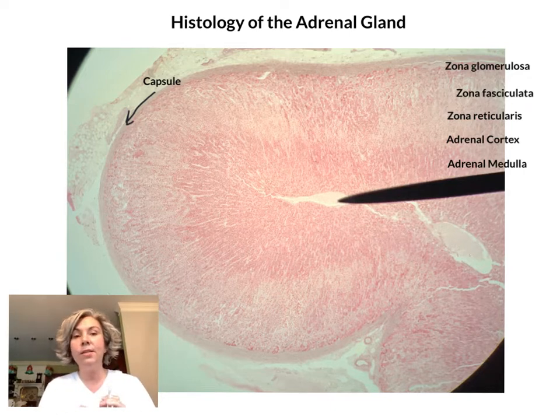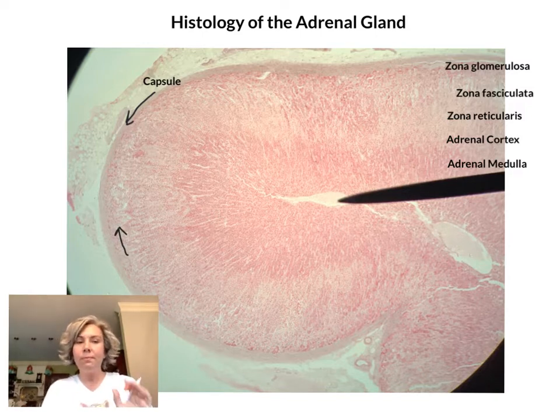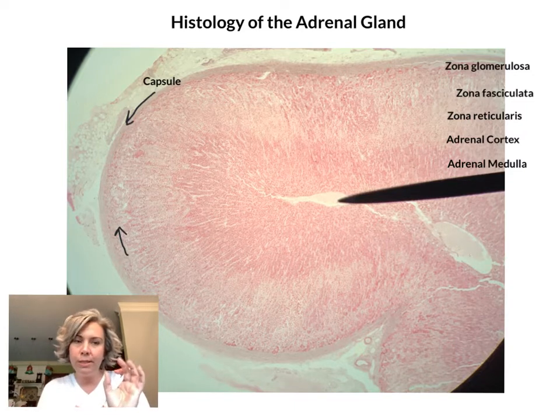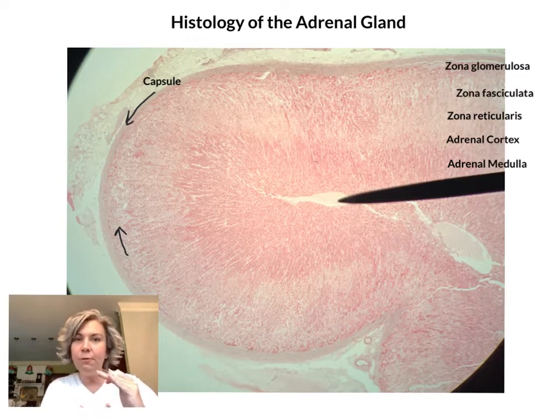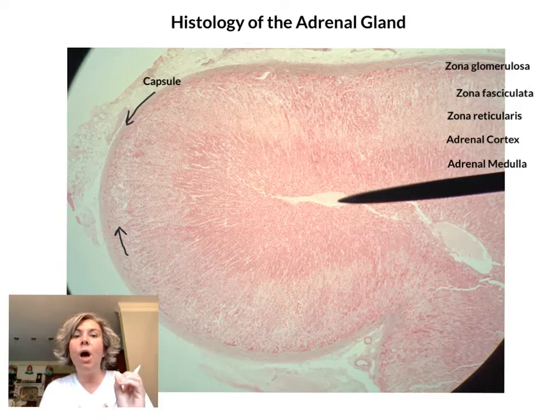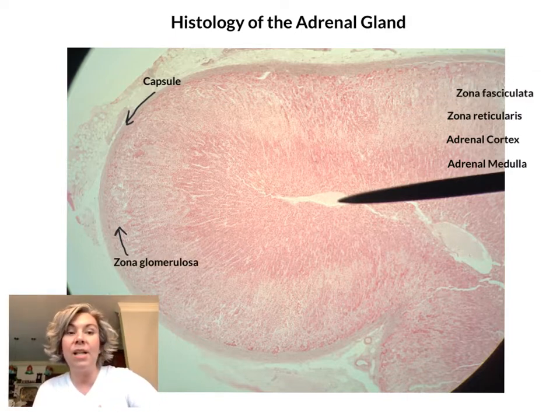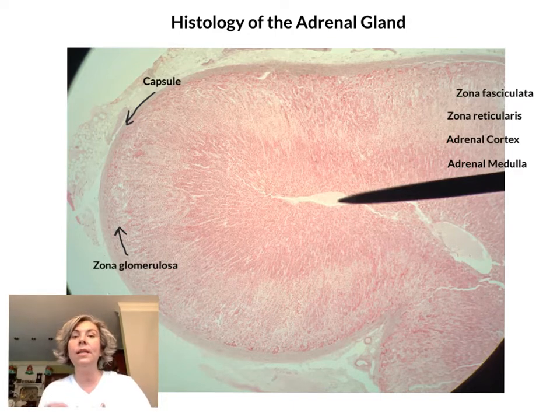The zona glomerulosa resides just underneath the capsule and it's actually quite a thin layer — this lighter region here just underneath the capsule. These layers are very subtle as they change, so you really have to look closely. If you examine the photo you can see differences in the pattern of cells and also in their coloration. The zona glomerulosa is always just underneath the capsule, and it secretes aldosterone.